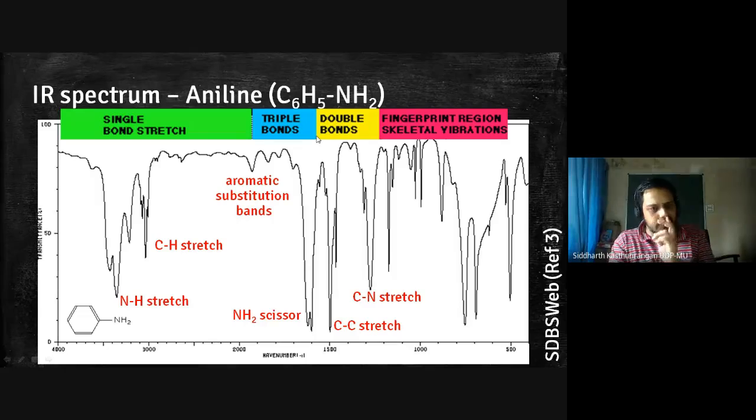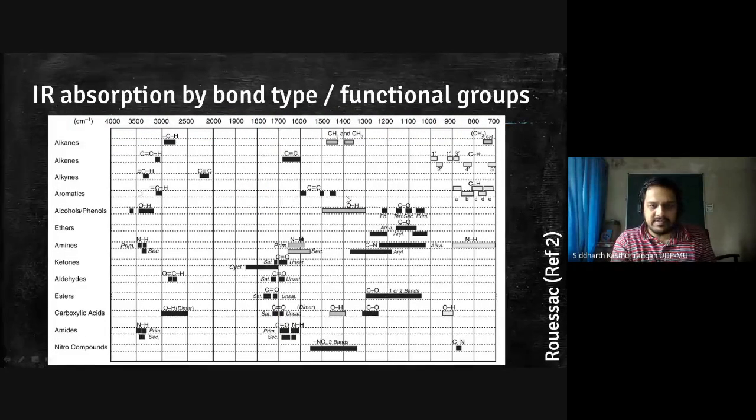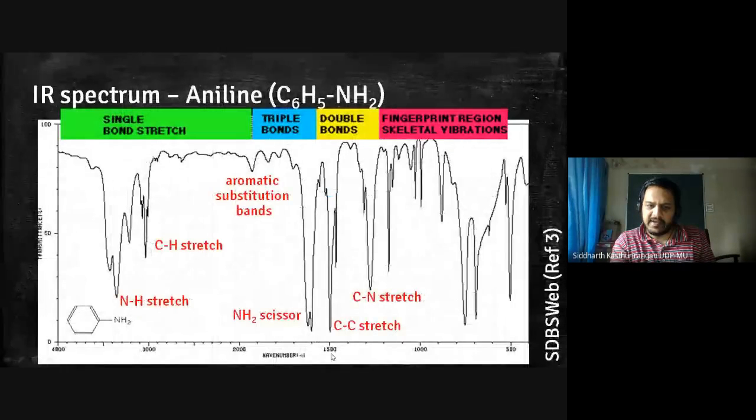For aromatic compounds, the vibrational bands are expected near 1600, 1500, and 1450 roughly. So we can see whether there are bonds. This is 1500, this peak is there. This is the CC stretching, the C double bond C stretching vibration which is producing these bands. In an aromatic compound, you have C single bond C also and C double bond C also. Each of these corners has one carbon atom. I hope you know the benzene structure. So then this region, 1500, 1450 and 1600.